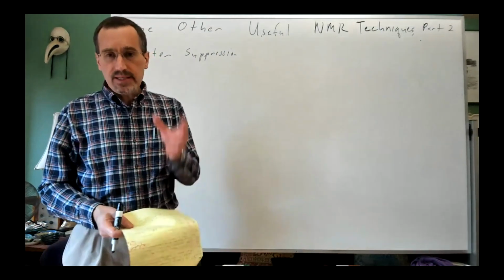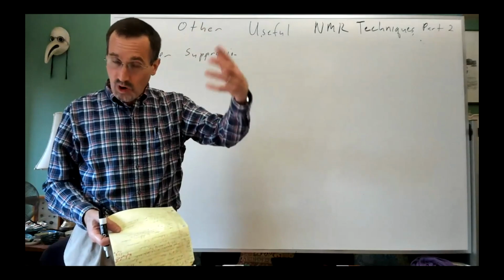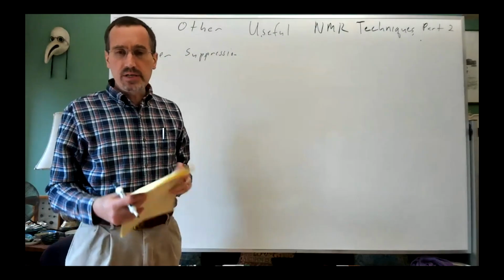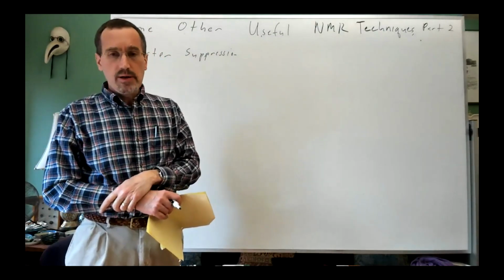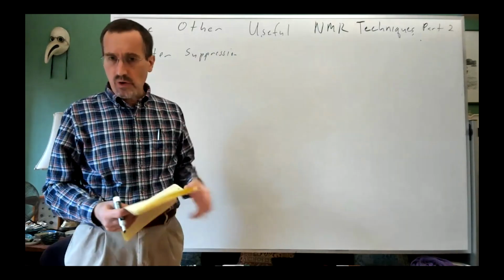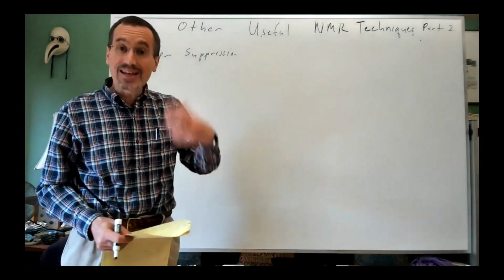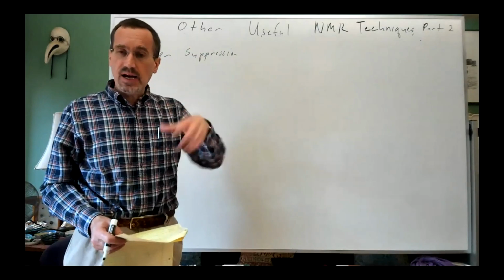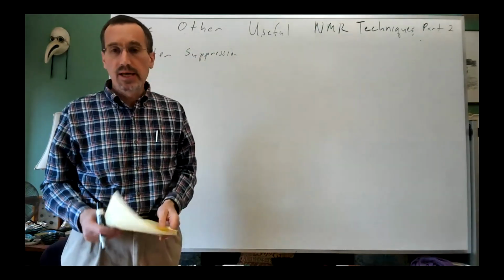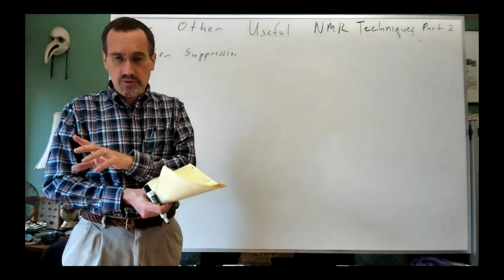Now, the problem is that if you dissolve up your sample in water, in order not to get a big water peak, you normally dissolve it in D2O. But the NH groups exchange with the D2O so that you won't see them. In other words, the NH groups become ND groups on the time scale of your handling the sample. So you need to run your sample in water in order to be able to see the NH groups.